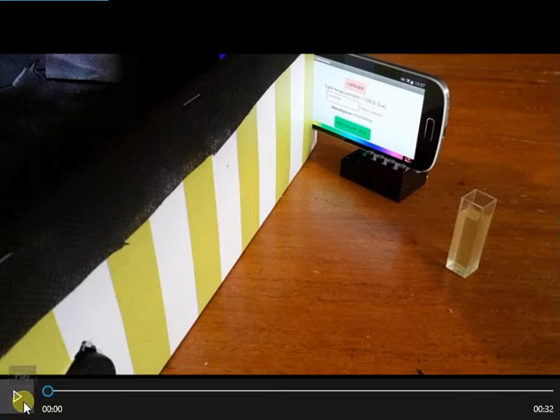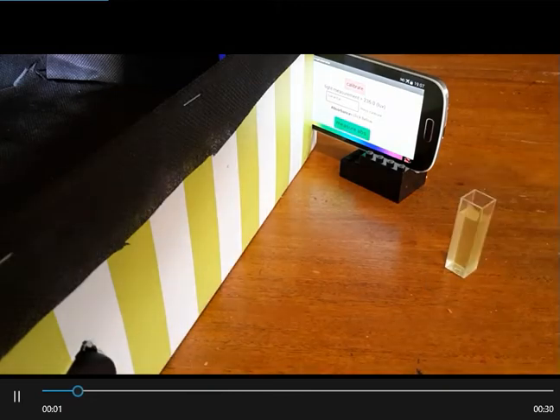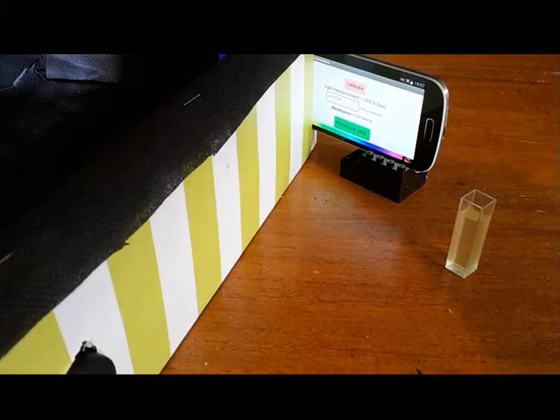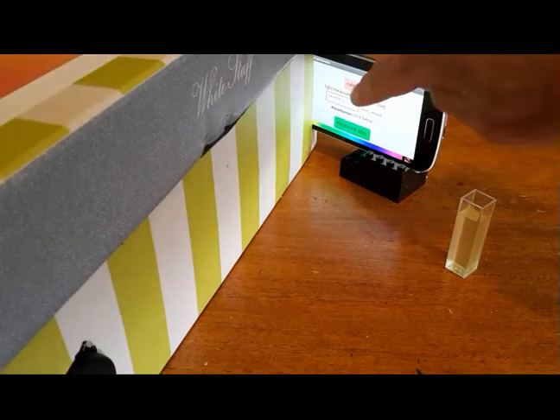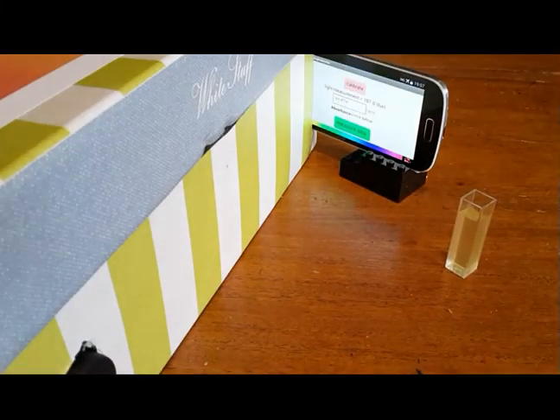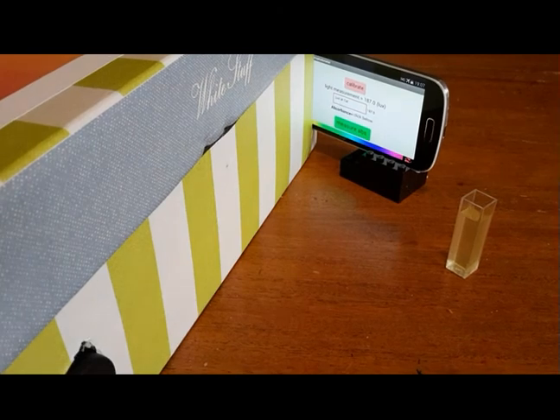it'll talk you through what's happening. So I've got my water, which is my blank, because it's the solvent I've used for my sample. Put the lid on and I press calibrate. And that value is stored by the app, the calibration value.